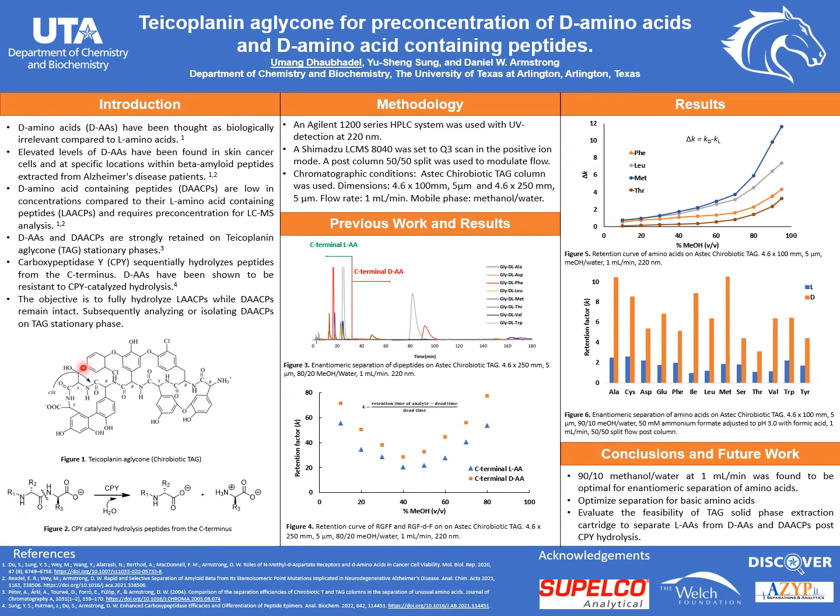To our benefit, D-amino acids are resistant to hydrolysis by CPY. So the overall objective is to hydrolyze the L-amino acid containing peptides while the D-amino acid containing peptides remain intact, and it helps us to isolate and analyze them using TAG. The instruments used in this project, along with the column dimensions and the chromatographic conditions, are listed over here.